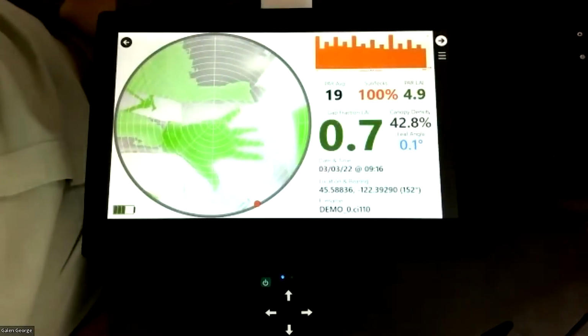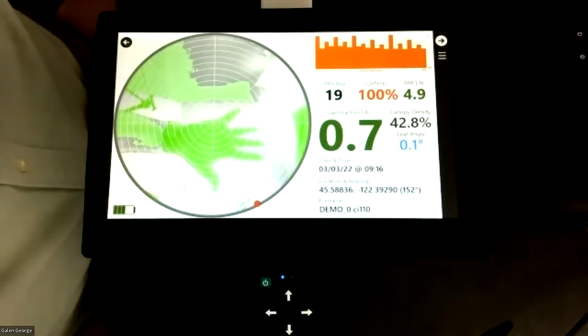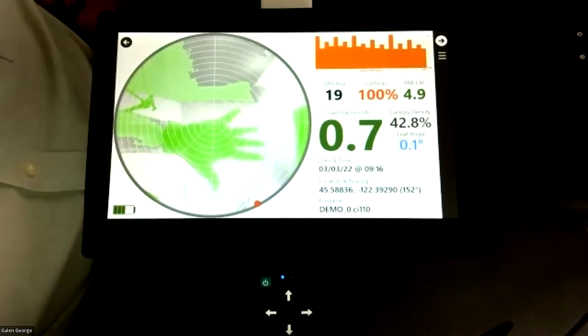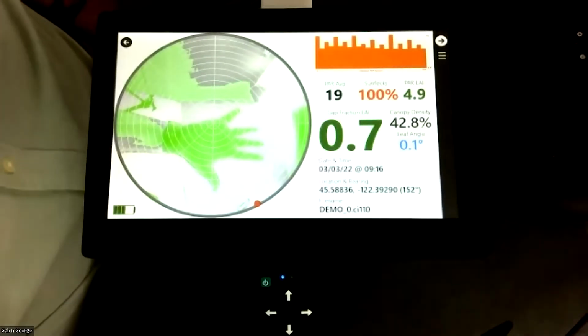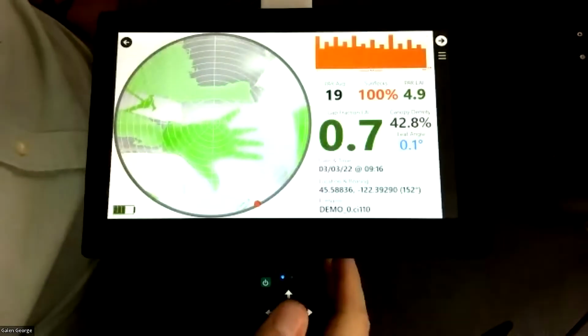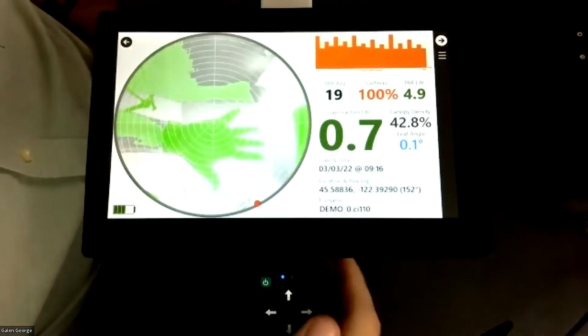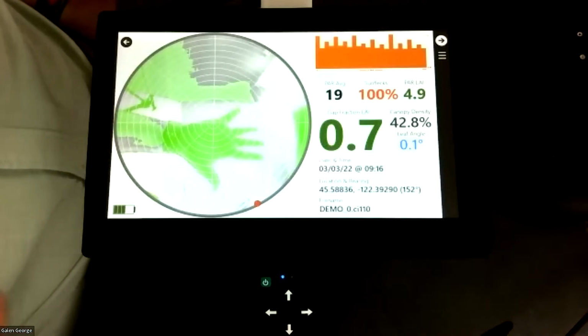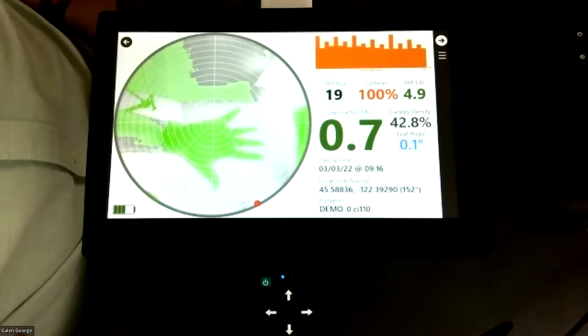So every individual measurement, you'll be able to pinpoint to an exact spot where you took that measurement and exactly what time of day, what day, and all that. So all that information is traceable, and you'll be able to easily access that. From a measurement, there's a lot you can do here. This was just the initial measurement.